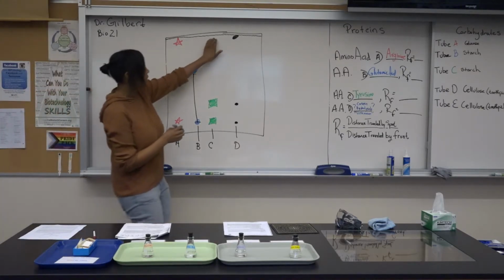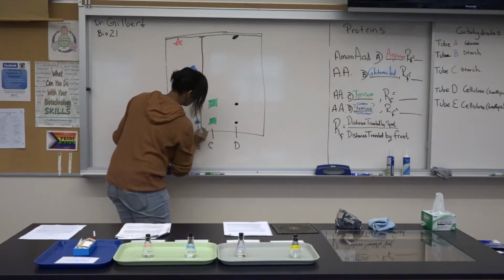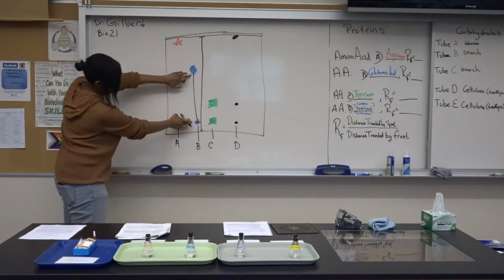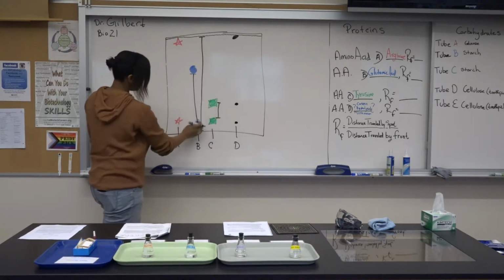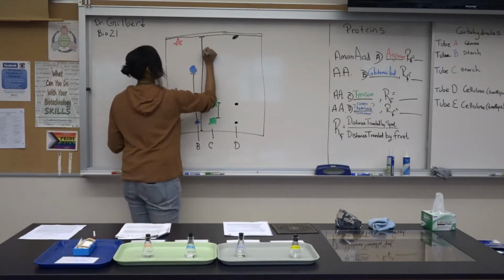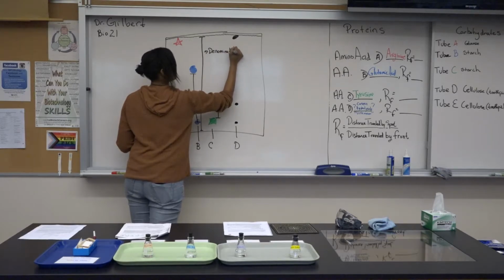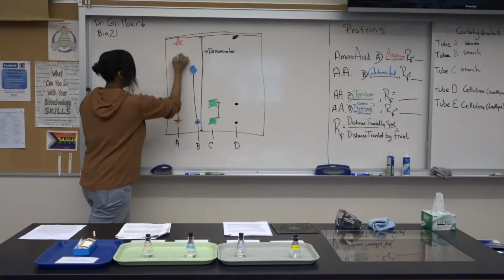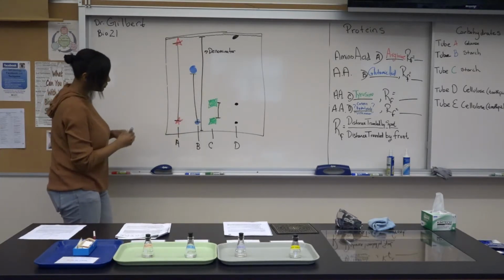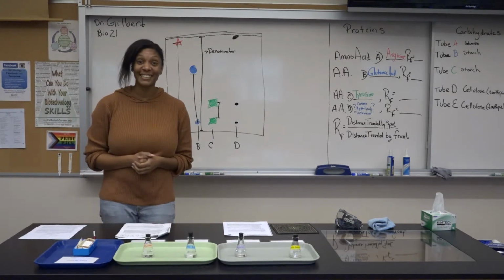It doesn't matter as long as we are comparing the ratio of this distance to the ratio of this distance. And do the same for this one, compared to this distance, and then this one here. All right, let's actually do it.